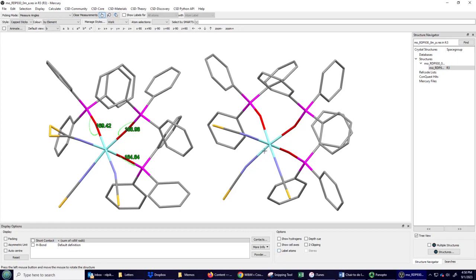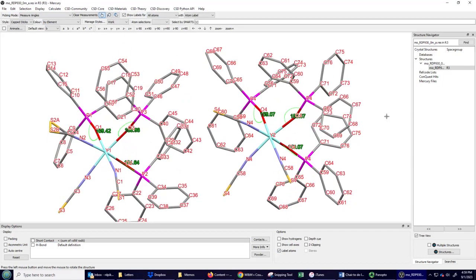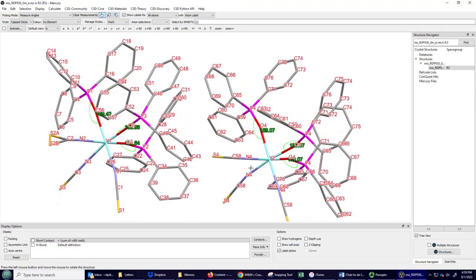And then over in this other molecule, I only need to pick one of them, because since we have oxygen 4 every time, any one I pick will be exactly the same as the others because they are created by symmetry. They're all the same. There's a threefold rotation axis in this second molecule, the one with yttrium-2, which means only one of these yttrium, oxygen, phosphorus with the phenyl groups is real. The other two are ghosts. They're generated by symmetry.